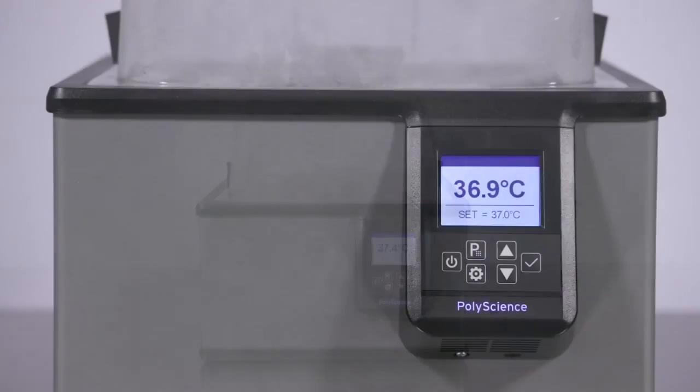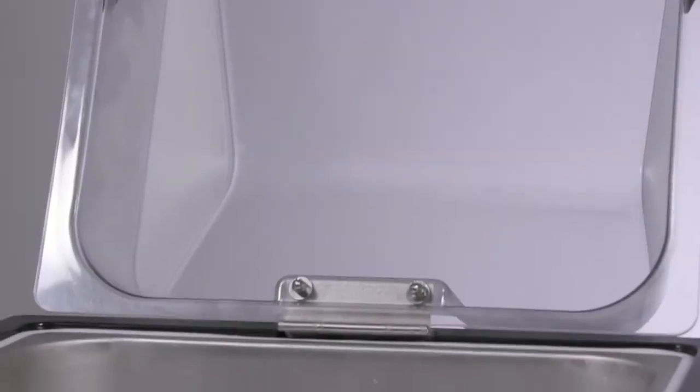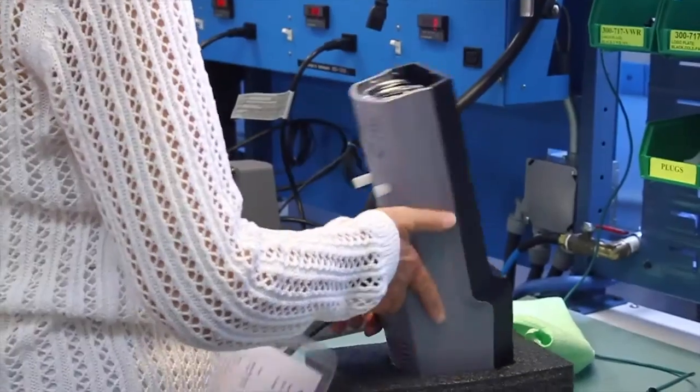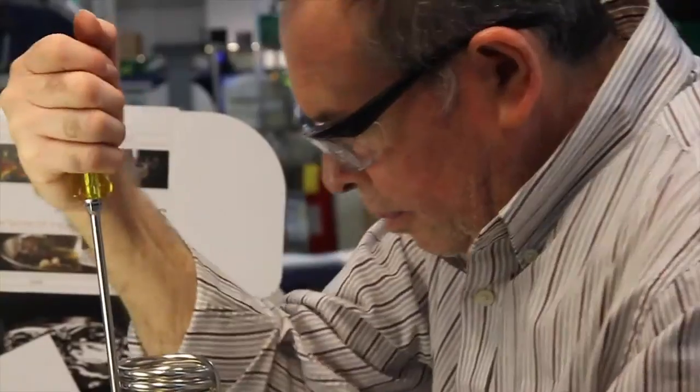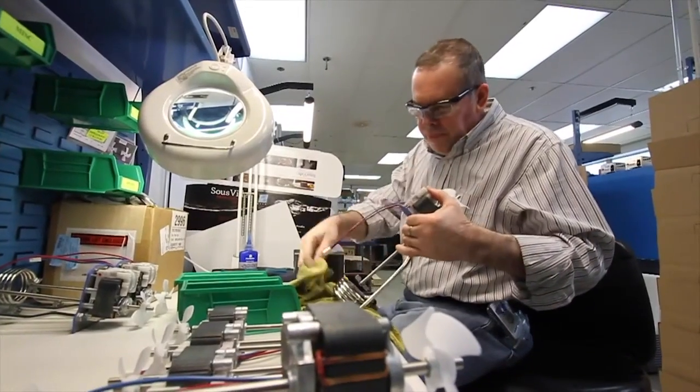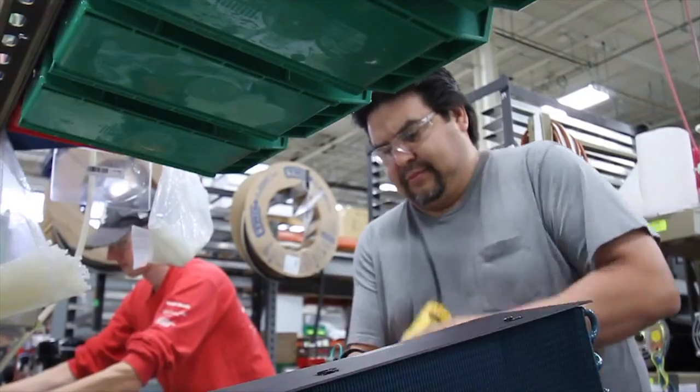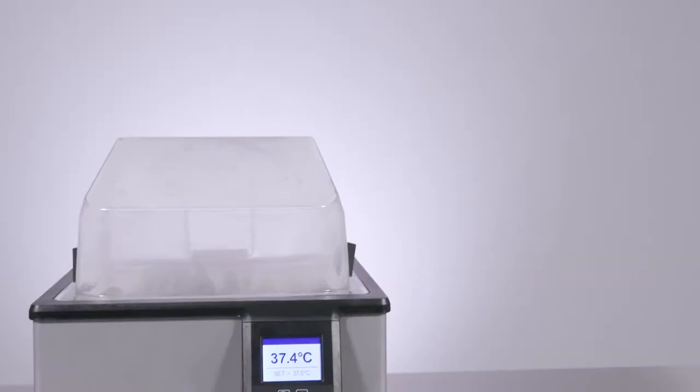The general purpose water bath is a fundamental product in the lab. Many manufacturers often sacrifice quality and innovation strictly to meet the demands of a tight budget.